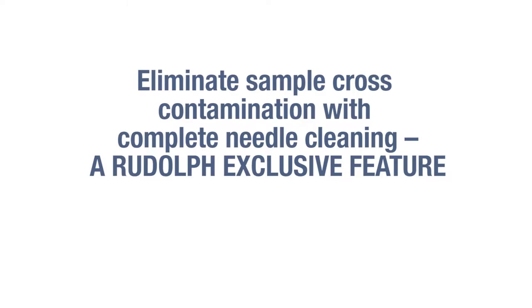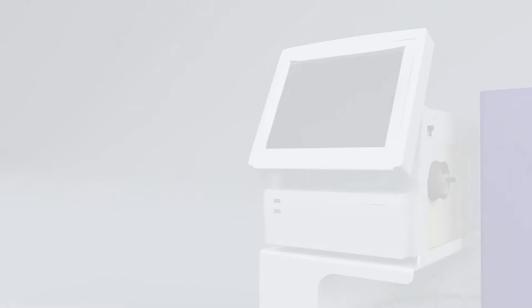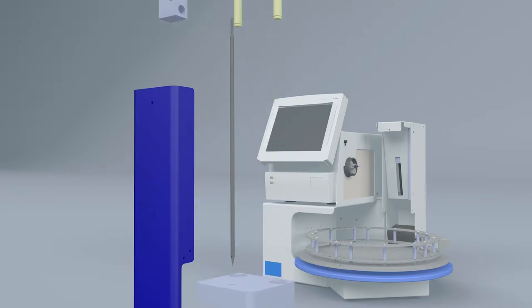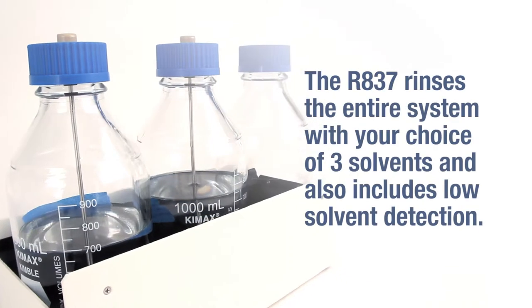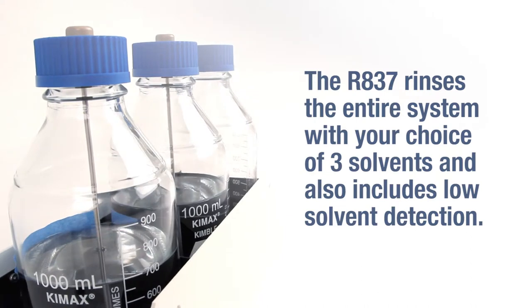Eliminate sample cross-contamination with complete needle cleaning — a Rudolph exclusive feature. Automation systems should have no net effect on your sample measurements. The Rudolph R837 is the only brand that cleans both the inside and outside of the needle to eliminate cross-contamination. The R837 rinses the entire system with your choice of three solvents and also includes low solvent detection.